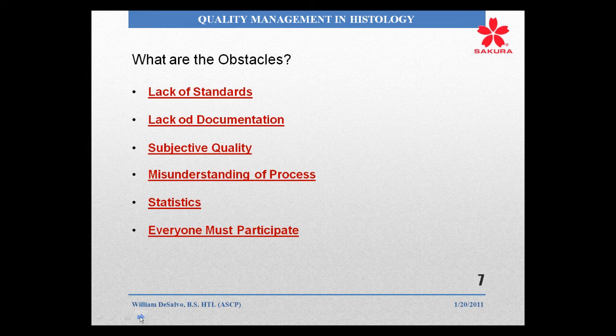Now, with more and more digital pathology, we're going to have to see more standardized, acceptable quality limits. If you're doing imaging for HER2-neu, there is a much higher standard of quality for that particular test that is starting to spread through the rest of histology.